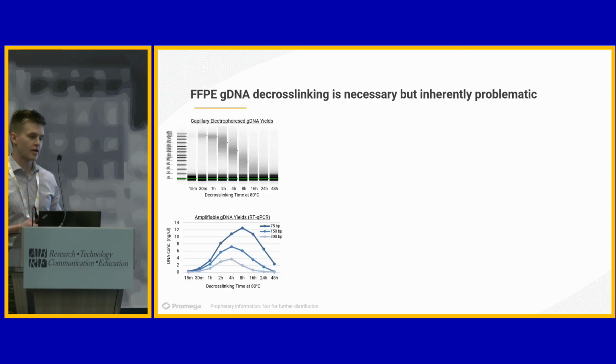So we first characterized the role of the decrosslinking incubation for an FFPE DNA purification. And as you can see here, with too little time, the DNA is still cross-linked. It doesn't purify well, it doesn't hybridize, it doesn't amplify by polymerase. And with too long, the DNA quality is compromised and begins to degrade. So there's a sweet spot of between 4 and 8 hours, and this is temperature dependent.